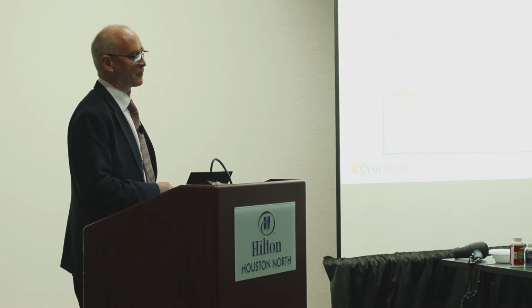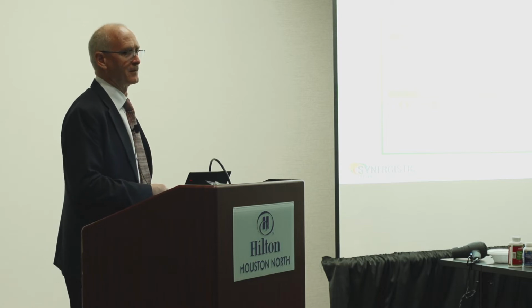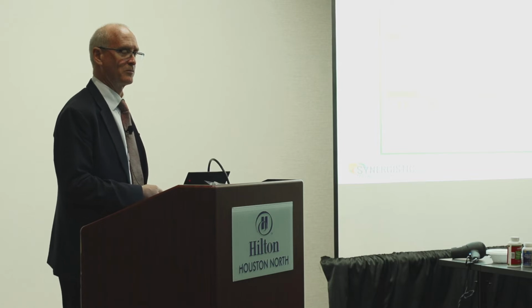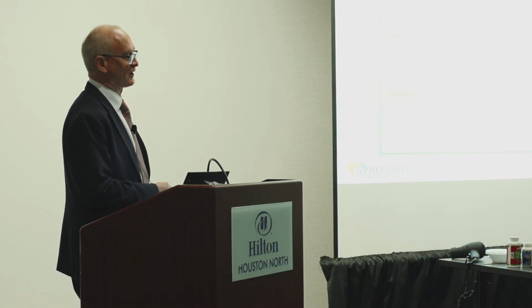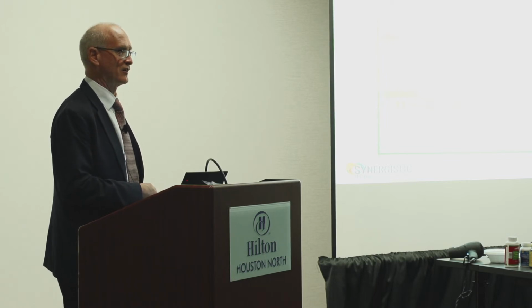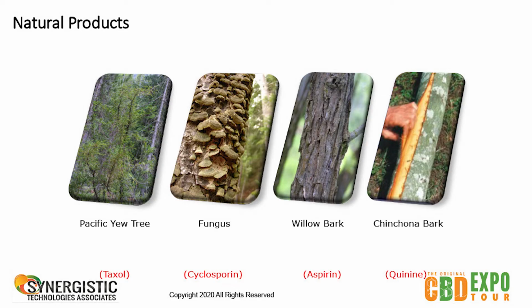There's a lot more emphasis on things such as CBN. CBN is not made by the plant. It's a synthetic cannabinoid because it's been through a degradation product. Delta-8 THC is another product that is made through the degradation cycle. So these other products can also be in that mixture, and as you're doing an extraction or doing a formulation, you can inadvertently make these other compounds, and that's why testing is important to have in your facility.